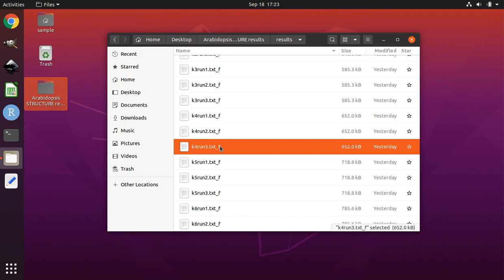Another one of those runs had a negative log likelihood that was lower. So I go for the run that had the negative log likelihood in the middle. Your results may be different from mine. So for you, instead of it being run 3, it might be run 2 or run 1, because every time structure runs, it runs differently. But you want to pick the one out of that set of replicates that's in the middle of that set of replicates. So even though it's 4 ancestral groups, which run is in the middle?